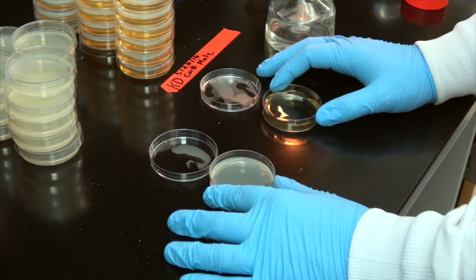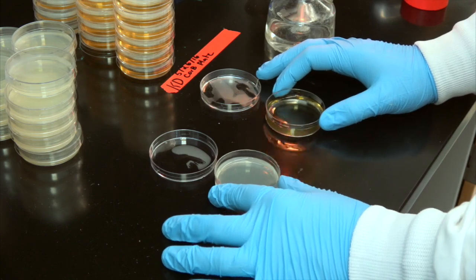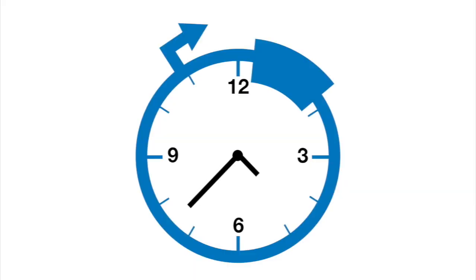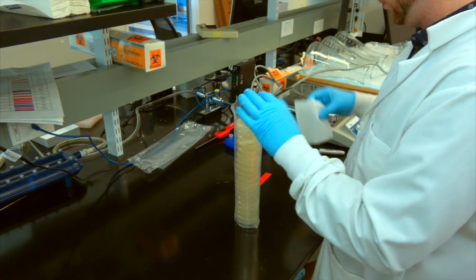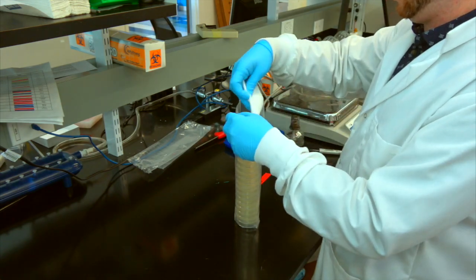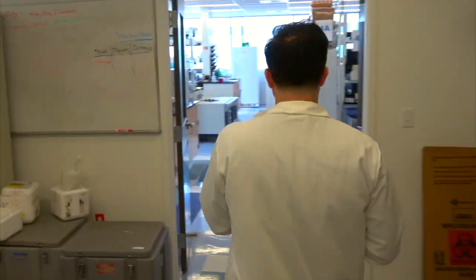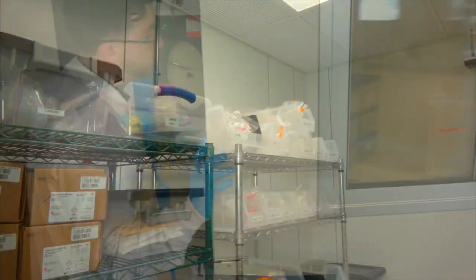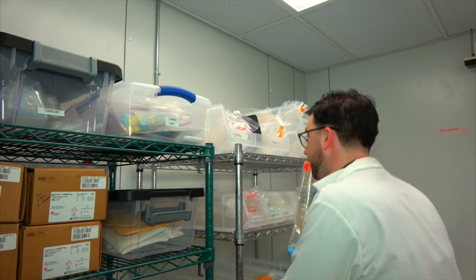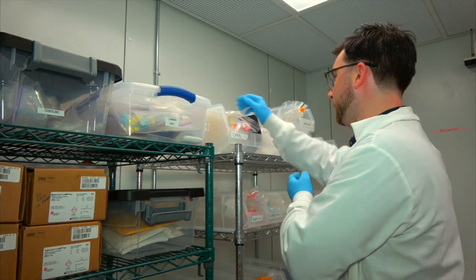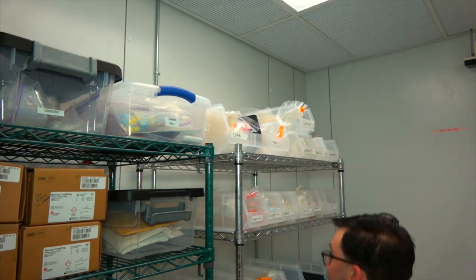It takes roughly 30 minutes for our plates to solidify at room temperature. However, we leave them out overnight to allow them to dry. Once dry, we place the plates in a plastic bag with an absorbent material to reduce condensation. For long-term storage, we keep our plates in the cold room at 4 degrees Celsius. Even when stored at this temperature, plates should always be checked for contamination prior to use and should never be stored for more than a month.